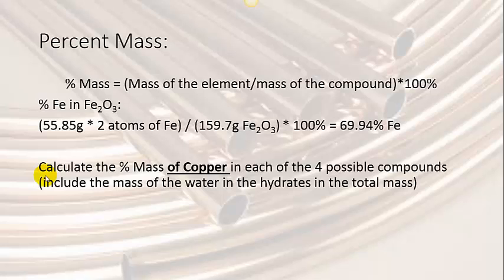And you should do that really before you even come to lab. Make sure you include the mass of the water in the hydrates. You have 2 different hydrates in the total mass, so the total mass that you divide by.